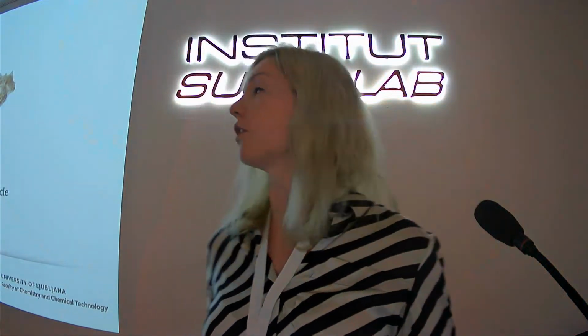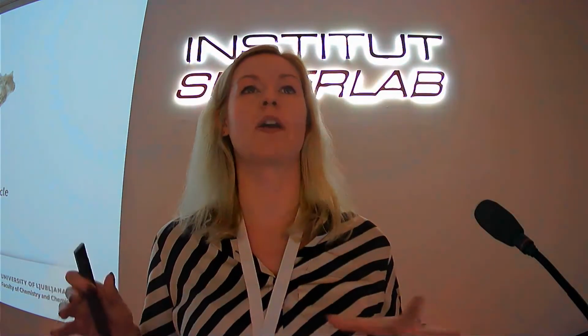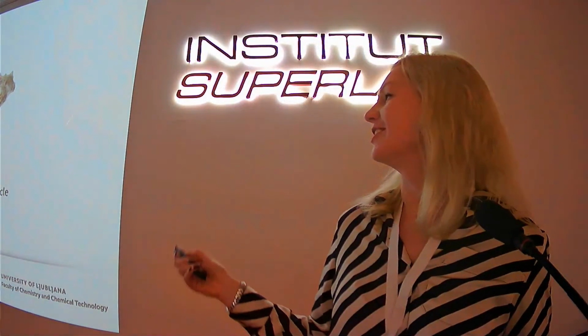But on the other hand, we also have this very irregularly shaped particle that has many sharp edges, and maybe also because of weathering in the aquatic environment, a lot of biofilms, so a lot of microorganisms, attached on the surface. And by characterization, these particles are both microplastics. But which one do you think is more environmentally relevant? Yeah, of course, the other one. So this is what we will talk about a little bit more today.